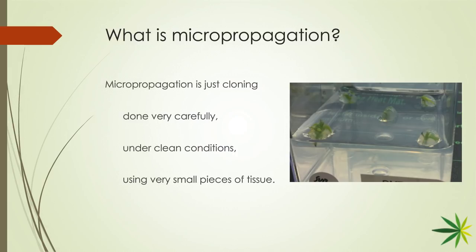It's just one of many methods that fall under the umbrella of plant tissue culture, which is a commonly used umbrella term, but micropropagation is a precise term that describes a very specific method. You can see in the figure on this slide a culture container with a clear growing medium in it, and some little bits of green matter encapsulated in that gel. Those are just the growing points that came from the plant, and they are ready to regrow.